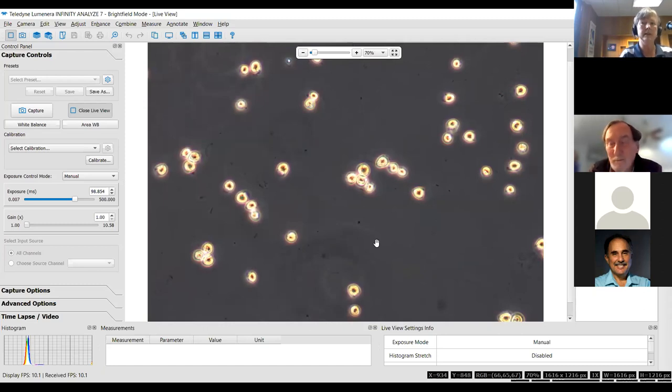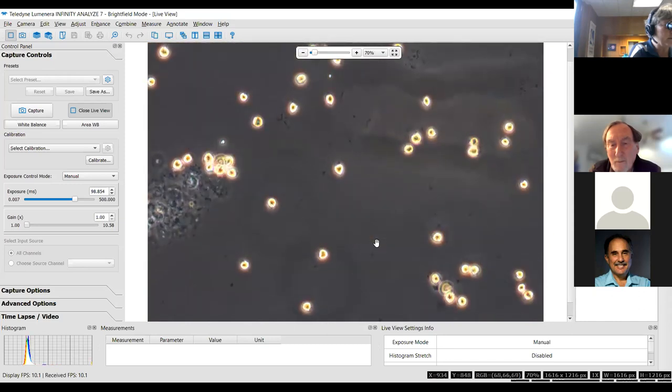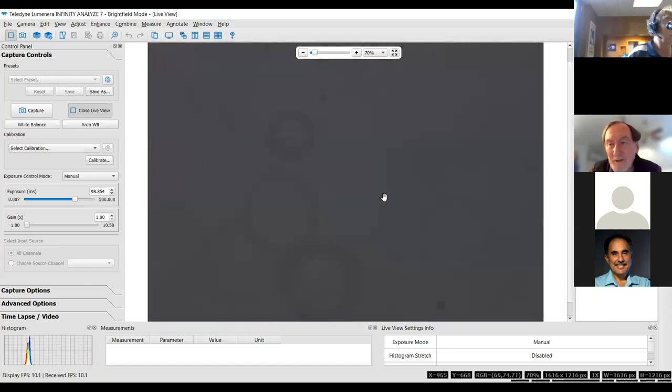But you know, it's common. It can bloom. It's a big taste and odor issue for water supplies at depth, as is Synura. It's a big spring bloomer. And you can tell there is not much else other than a few other things in the sample. This sample by numbers and biovolume was about 95% Uroglenopsis. Again, if you had it as a live sample, it would be a lot easier to see that there was a colonial assemblage.